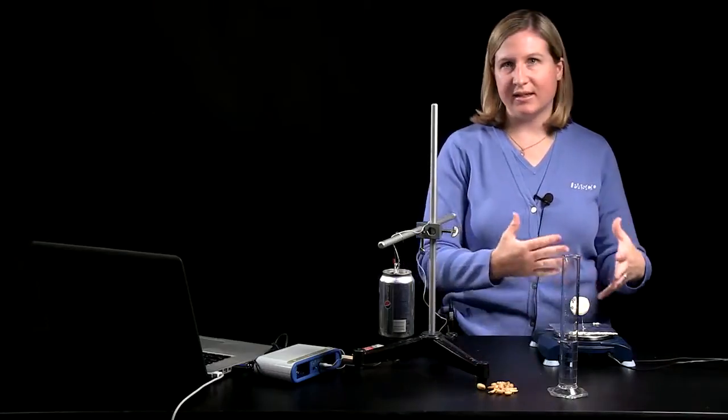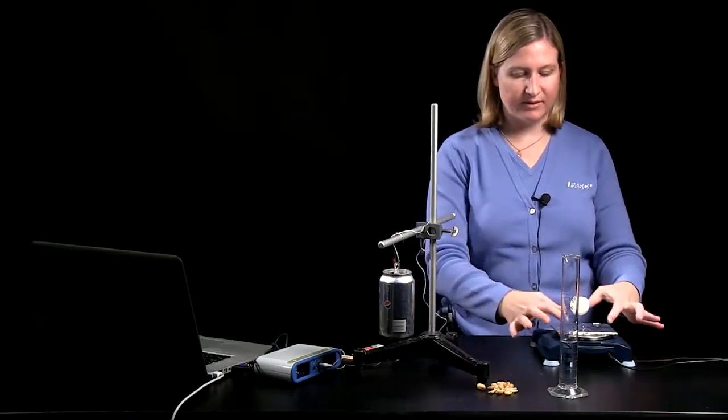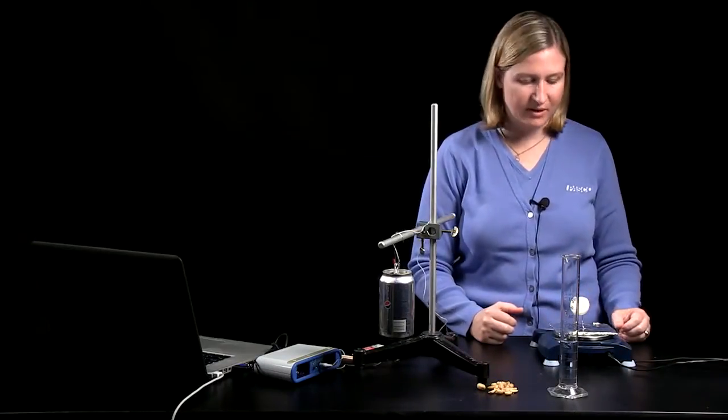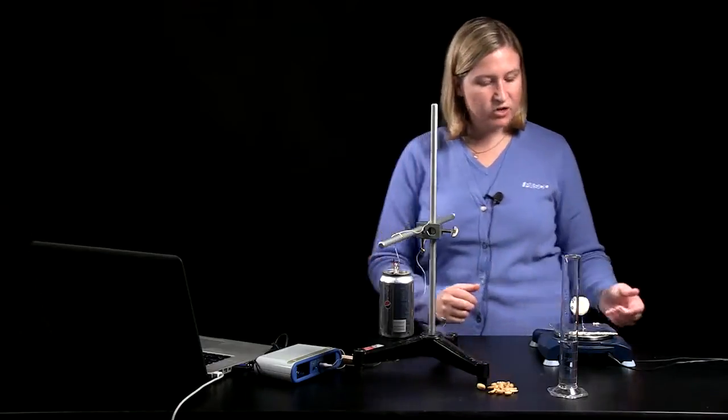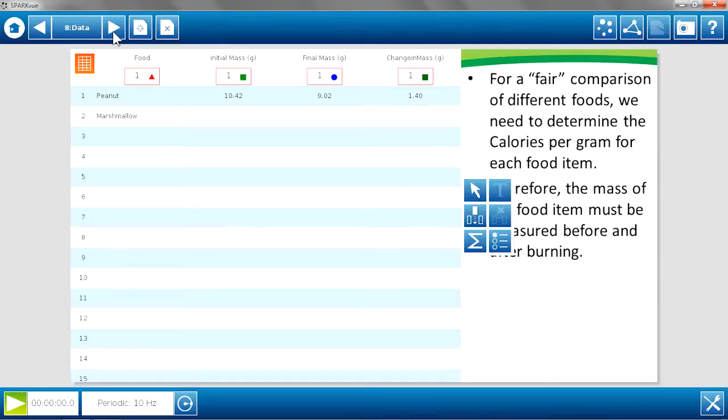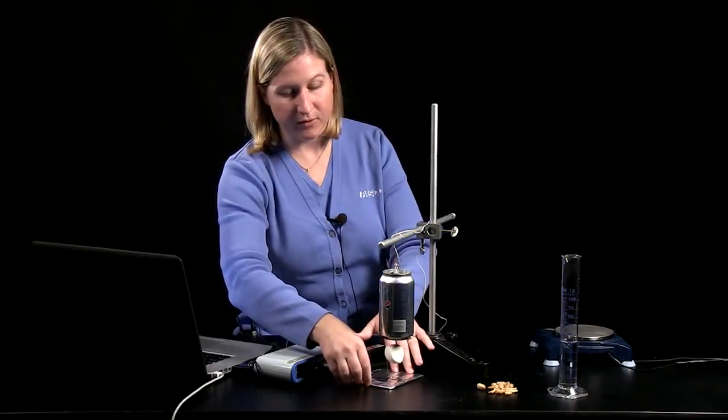When students get the initial mass of the food, it's important that they put the food and the holder all together on the balance. That way during burning anything that may fall off of the food is caught on the holder and can be counted for in mass. So my initial mass of the marshmallow and the holder is 14.44 grams. I'm going to type that into my data table. And I'll come back to this data table after I burn the food to get the final mass of the food.